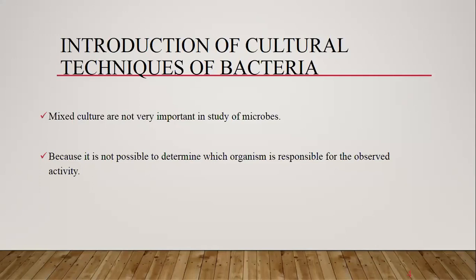To obtain the pure culture, different methods are used to isolate the bacteria. Normally, as we know, bacteria are normal flora. They are present everywhere, like soil, water, air. In that habitat, they are present as a mixed culture.